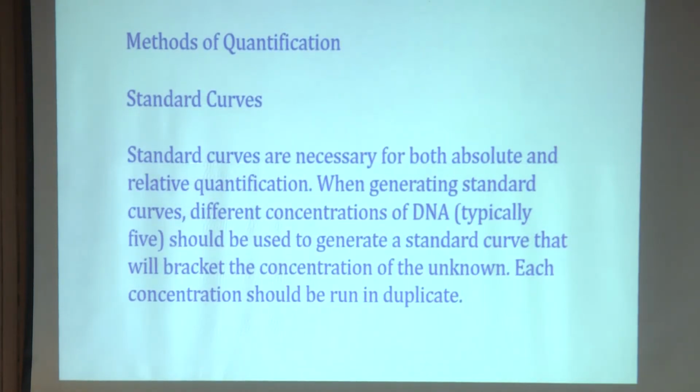There are several ways of preparing the standard curve. This is an important step, because your standard curve is going to play a major role in the values which you are going to get. So, if you actually amplify a template, a gene of interest, and then purify it, make serial dilutions, you can go for a standard curve. Or you take the amplicon, clone it, put it in a vector, isolate the vector, purify it, prepare serial dilutions, and then you go for quantification.